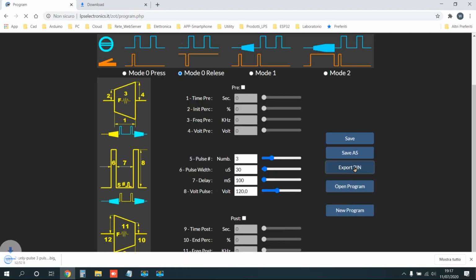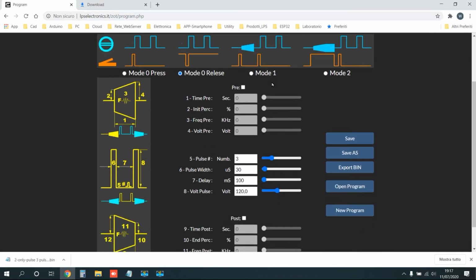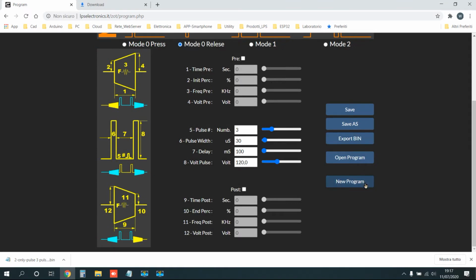So click on web, and you see that this is the name given by the application. So you can recognize the recipe later in the download directory, because it has the name that you gave to the recipe.